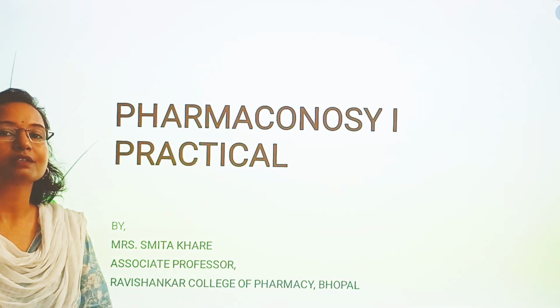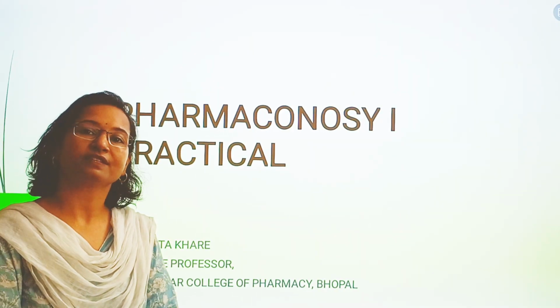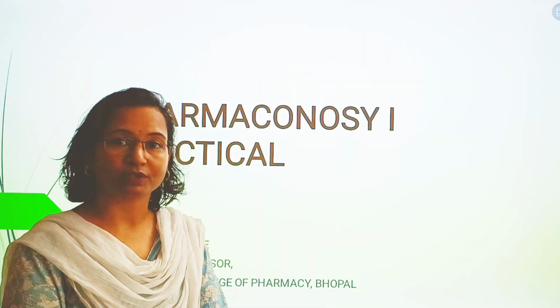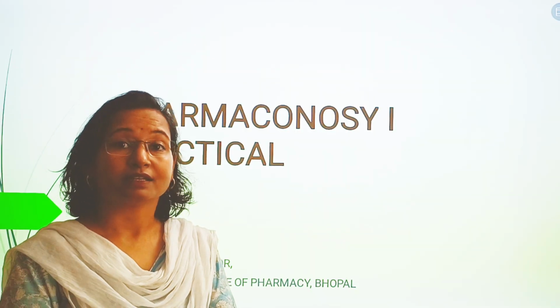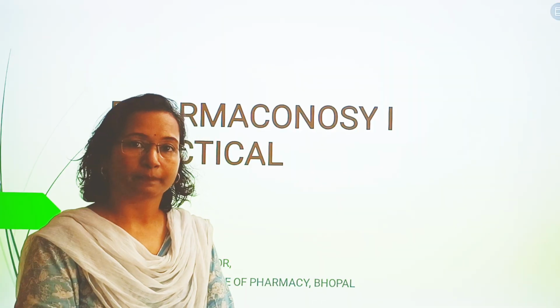Today we are going to discuss a pharmacognosy practical based on evaluation, specifically physical evaluation. Evaluation is confirmation of identity, purity, quality and detection of the presence of adulteration in a crude drug.